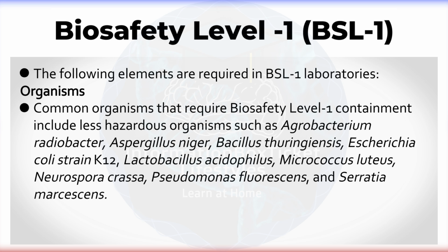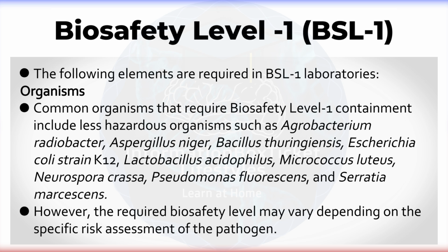Common organisms that require Biosafety Level 1 containment include less hazardous organisms such as Agrobacterium radiobacter, Aspergillus niger, Bacillus thuringiensis, Escherichia coli strain K-12, Lactobacillus acidophilus, Micrococcus luteus, Neurospora crassa, Pseudomonas fluorescens, and Serratia marcescens. However, the required biosafety level may vary depending on the specific risk assessment of the pathogen.